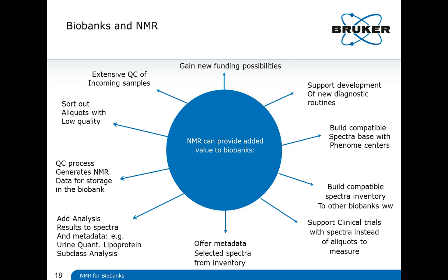Then the last thing is biobanks. Of course here extensive quality control is very important to sort out aliquots with low quality, or at least to mark them so that there is an issue. And of course the QC process is actually done in quite a few minutes, like 5 minutes, and then the spectrum can be recorded and transferred into the biobank, and then also the analytical data, as I showed you, quantification in urine, plasma, serum, can be done. So I think that is what I wanted to present.